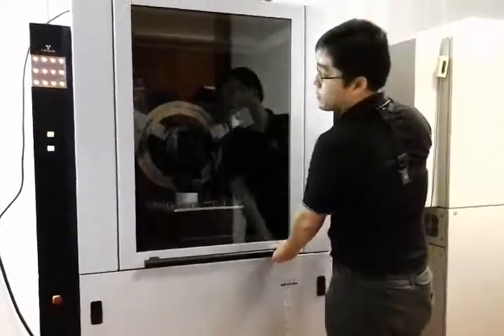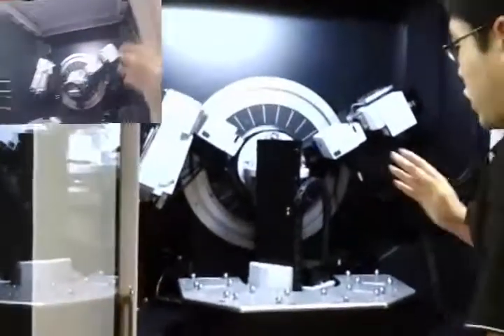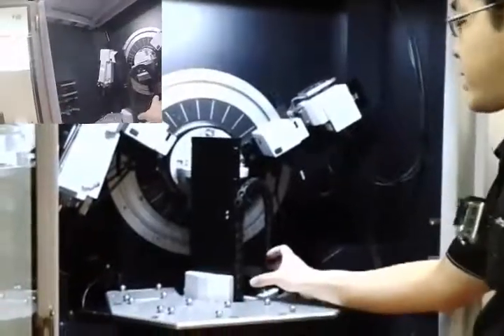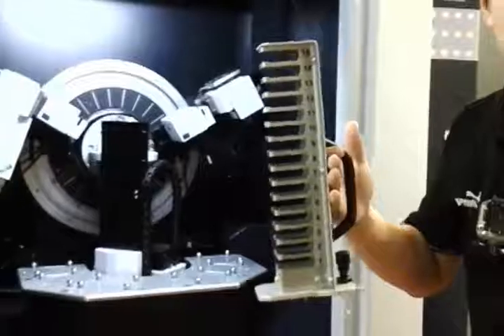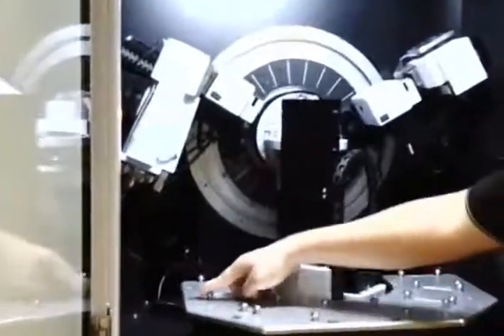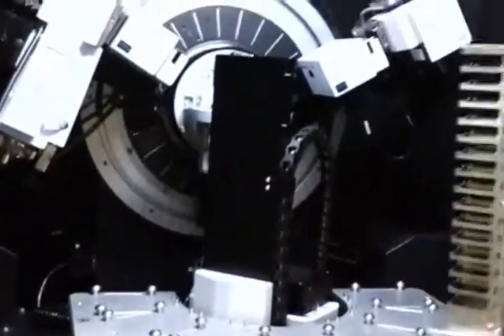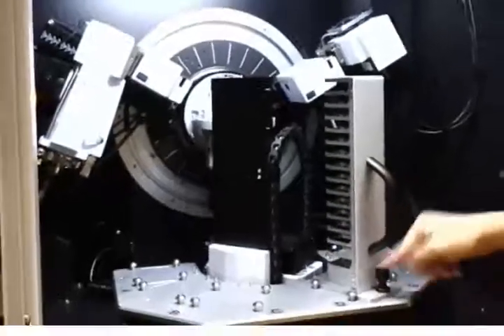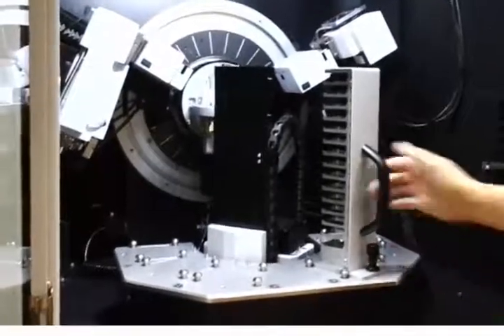Now I can talk about the interior part. This is the robot sample changer — there's a grabber here to grab the sample. This is the sample holder; each holder can hold about 15 samples, so you can just load the sample in and put it in. You can see positions B, C, D, E, F. You lock it and you can't move it; press again and you can take it out.